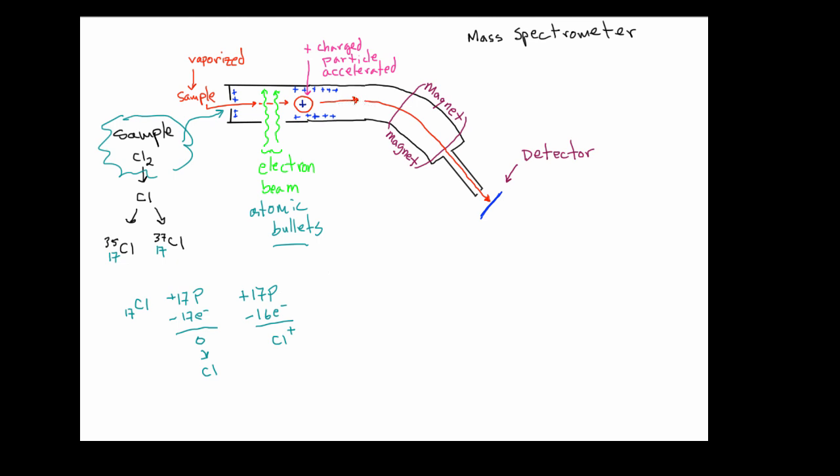And there will be a mixture in here because you're going to have Cl pluses, for example. I'll go ahead and write it in here. Cl pluses that are 35 for the mass number, and you're going to have Cl pluses which are 37. All right, and this is a mixture, and again, what we're doing is we're using the mass spec to figure out, okay, are there different masses in here? And if so, what is the percent abundance of each type?